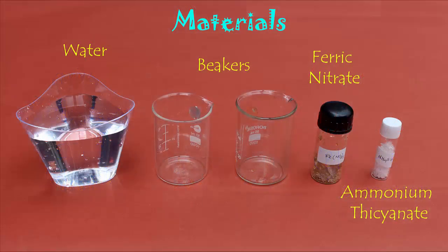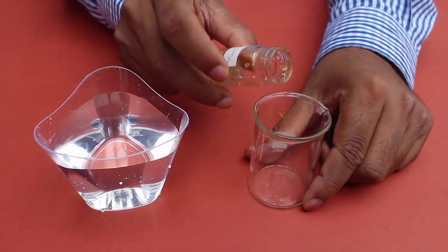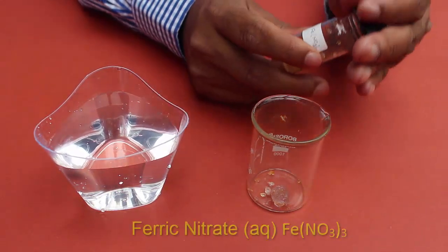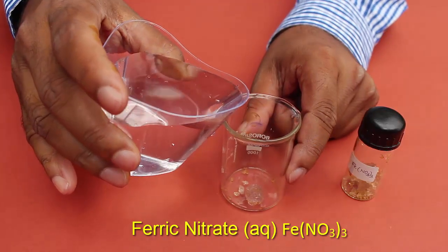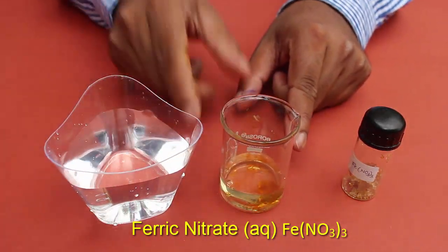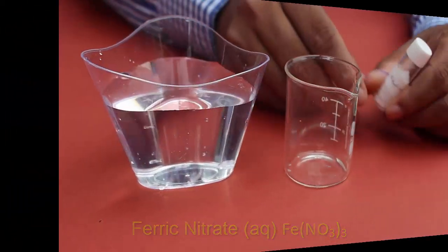Now we are going to prepare a solution of ferric nitrate. For this we have ferric nitrate crystals. The ferric nitrate is added to an empty beaker. Now add water to the beaker slowly and carefully. With a stirrer we can make the solution properly. Now this is the clean solution of ferric nitrate.